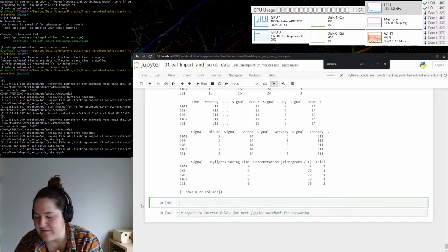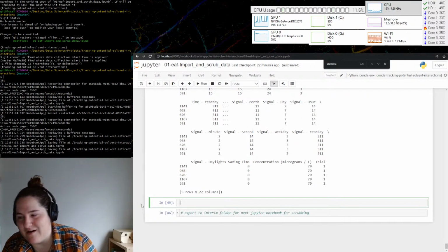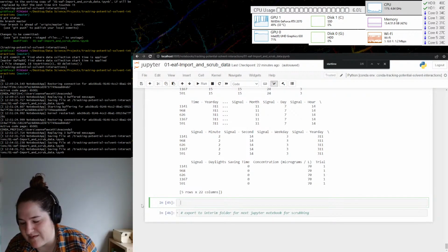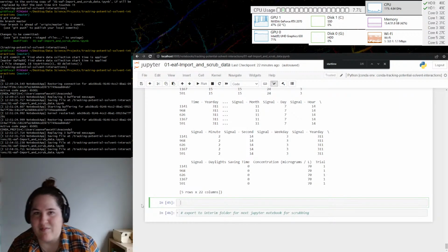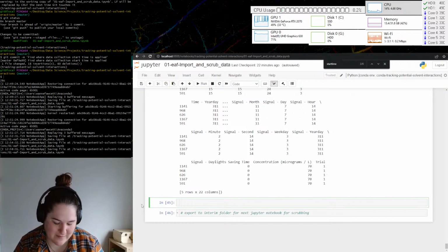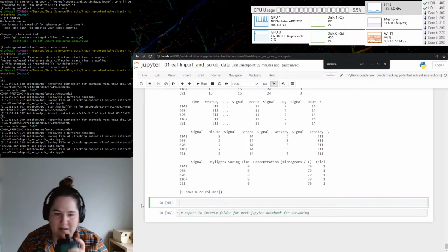All I know is that whenever I started using the GC, the first trial took forever to get set up and the instrument warmed up, because it's not just a plug and play thing. It's a little bit more complicated than that. So I don't know.